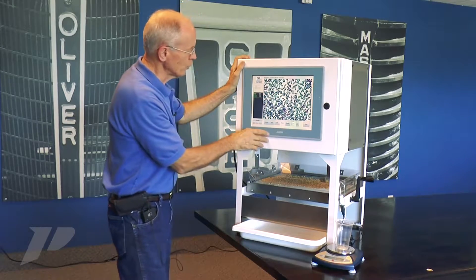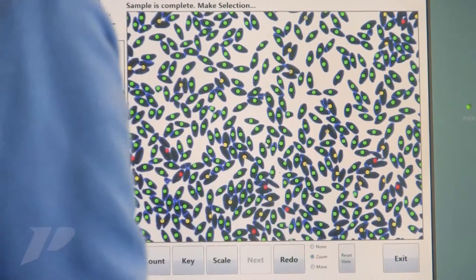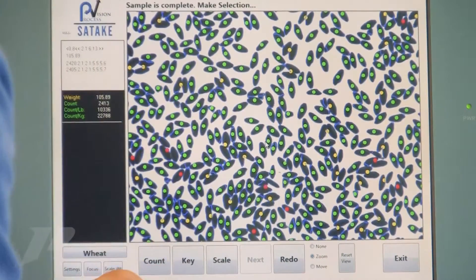The very small fragments we ignore, because we have a threshold to ignore small things. Half seed or greater will count.